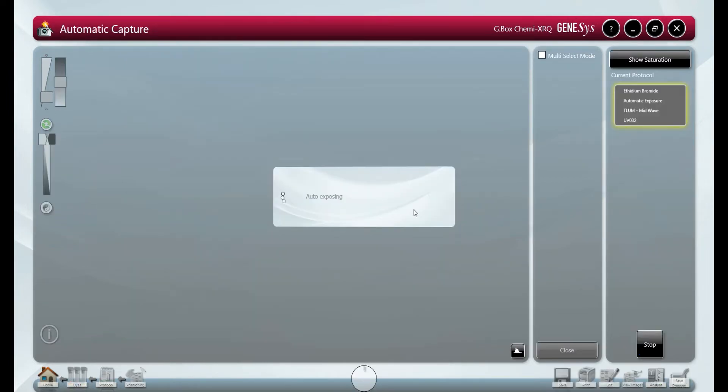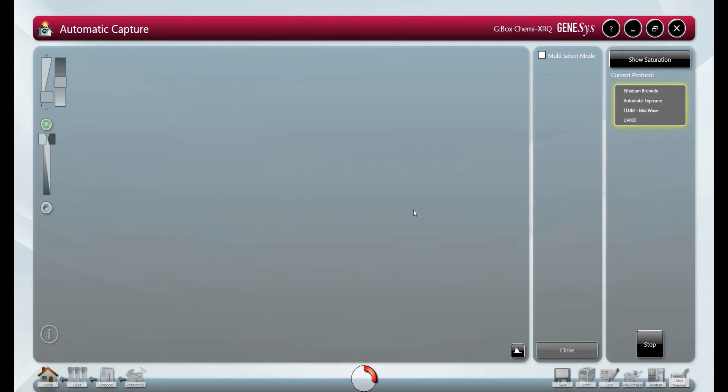Genesis will then calculate the exposure time needed and save the image of the gel. This will never saturate in automatic capture.